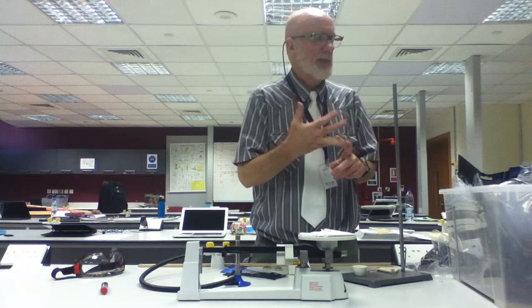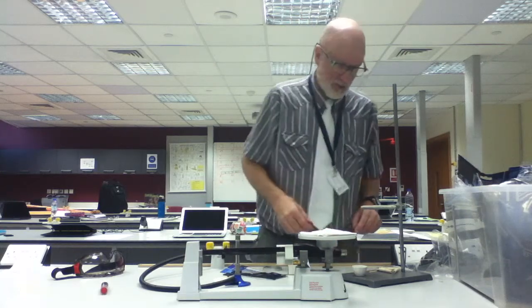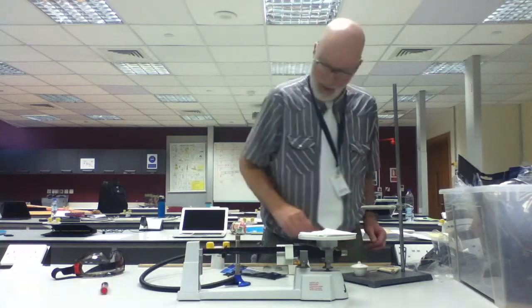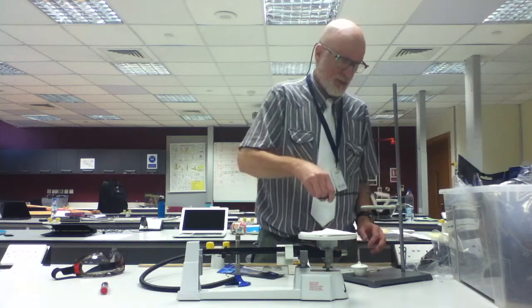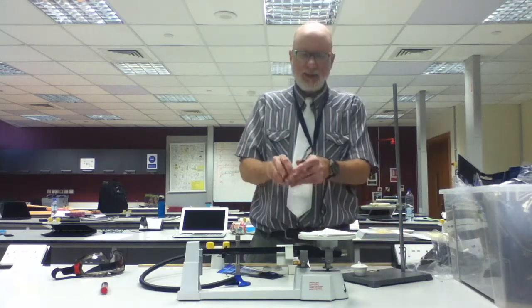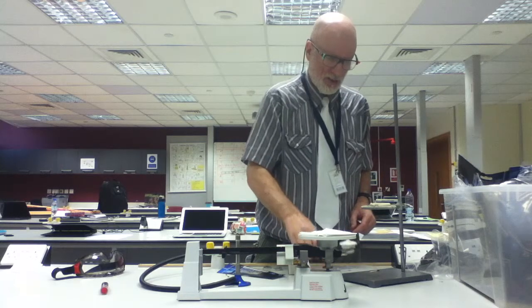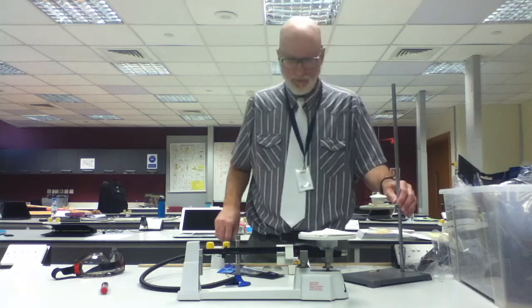So that's the mass of the paper plus magnesium. Then you take the magnesium and put it in the crucible. You put the lid on the crucible. You take your tongs. This may still be hot. Put your clay triangle on here, and then you take your crucible and put it on the clay triangle.